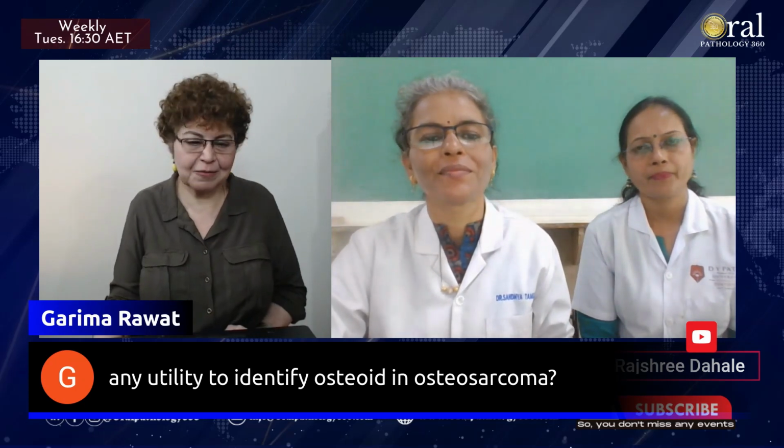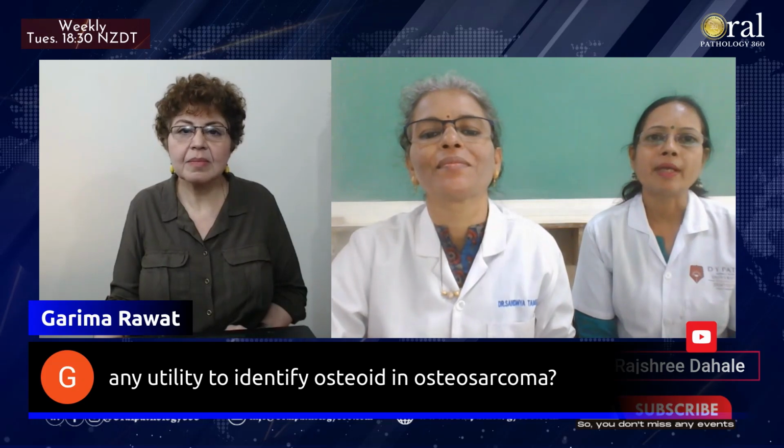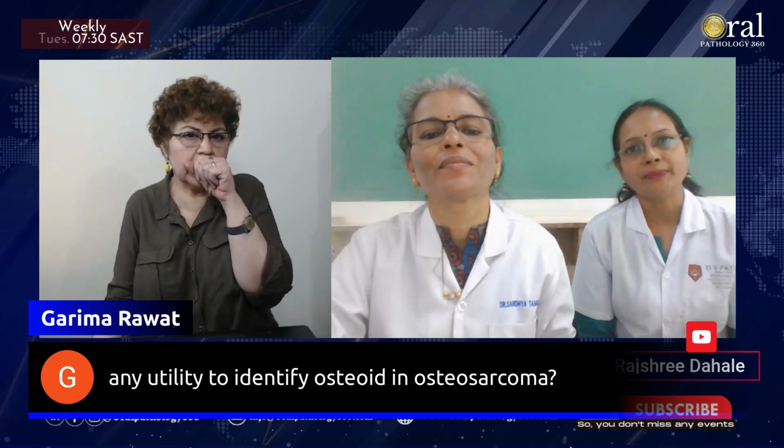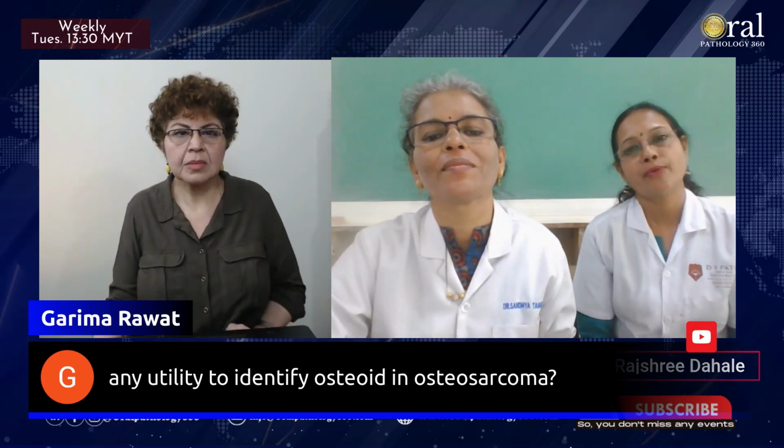Have you had any particular problems with the stain and how to overcome them? Any advice you can give for those who want to use the stain? Most of the time, cementum is not picking up the red color. So you have to change the carbol fuchsin. You have to use fresh, strong carbol fuchsin and not a diluted one. Okay, so there we have the how-to also right now.